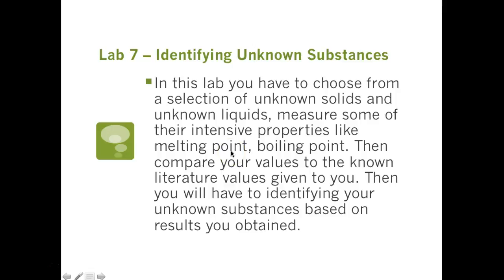So the solid is mainly going to be identified either by its density, its melting point, and also another key factor, solubility. Now there are certain solids that are highly soluble in water, whereas other solids are kind of medium in their solubility in water. And then there are yet other solids which barely dissolve in water at all. Then you'll take the values that you obtained from the experiment and compare your values to that which is known from the literature. And that's how you will identify your unknown substance.